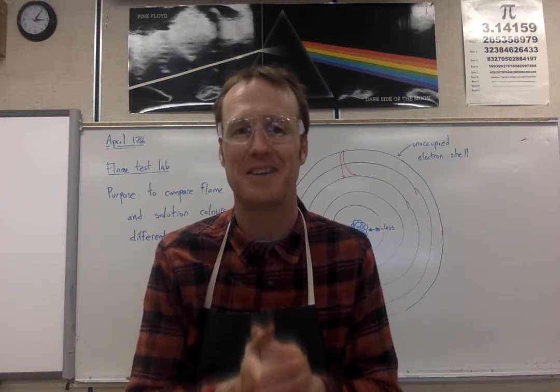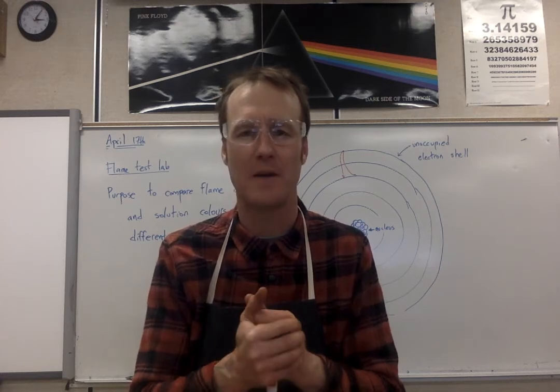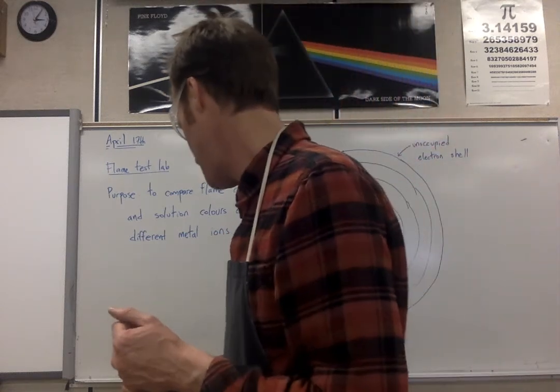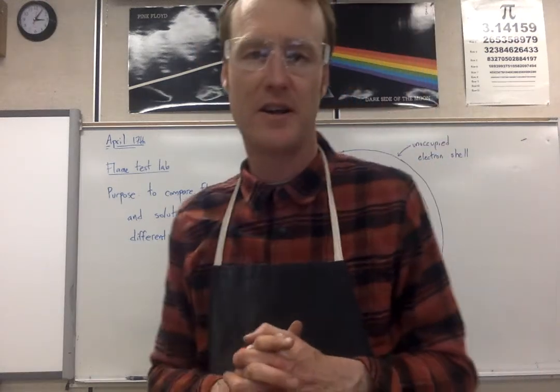And each of those results is going to have its own solution test and a flame test. So let's get going here. I want to get us into the results.